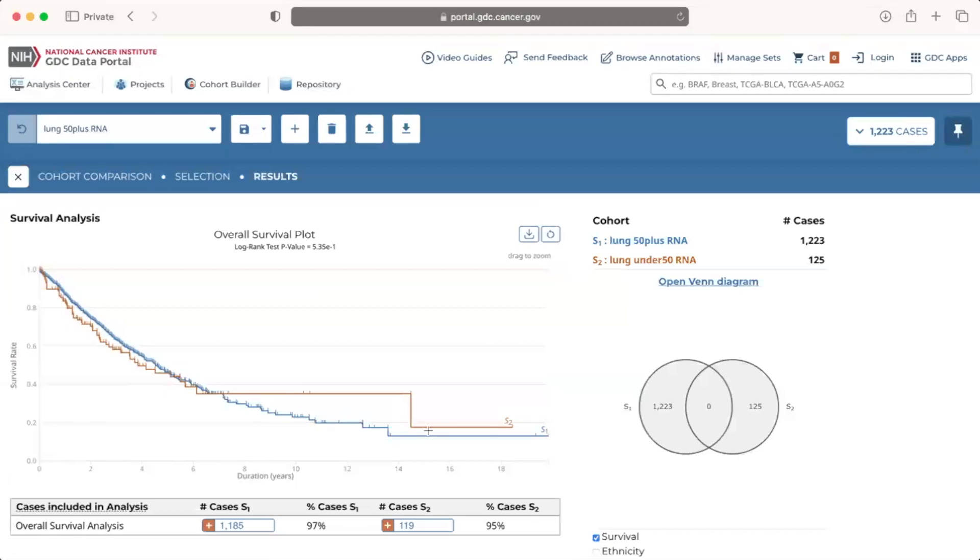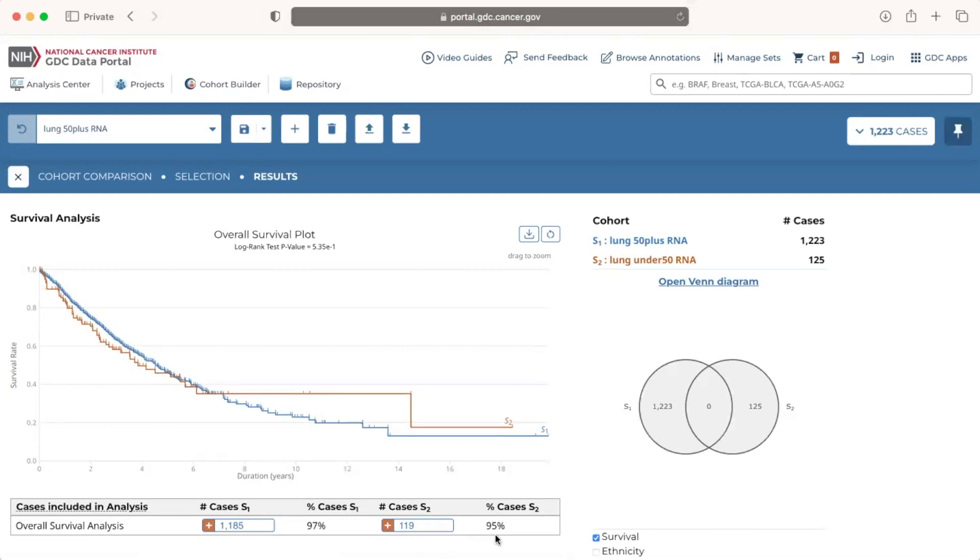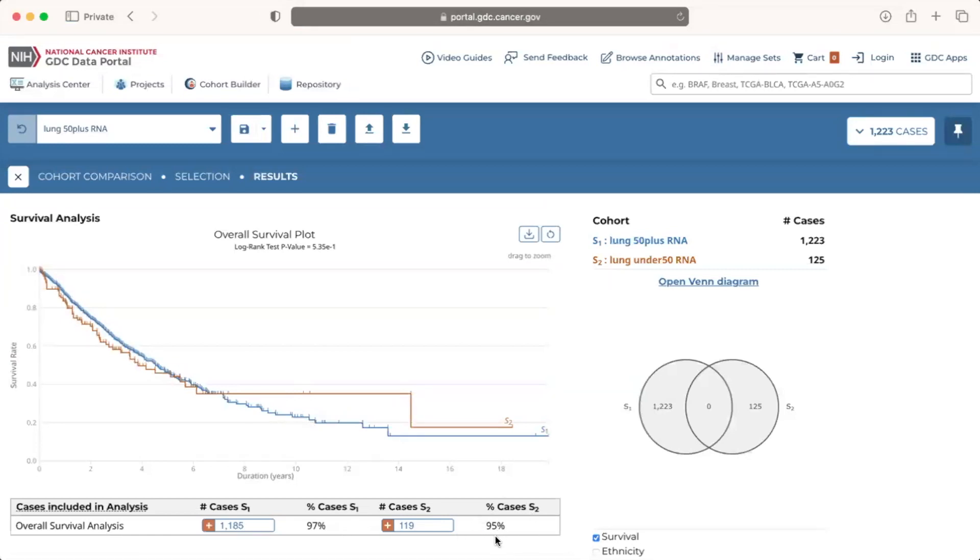Below the survival plot, we see a table with the number and percent of cases that were included in the survival analysis for each cohort. We can see that 97% and 95% of 50 plus and under 50 lung cancer cases with RNA-seq data respectively were included in the analysis.